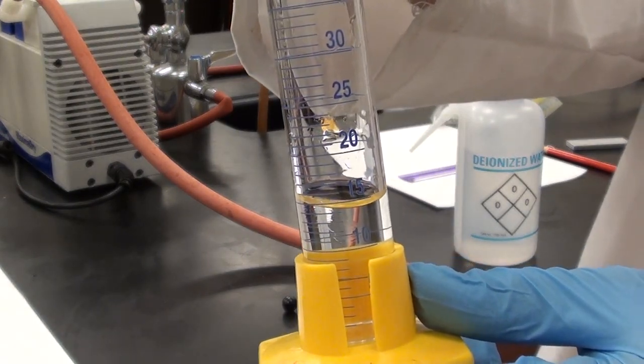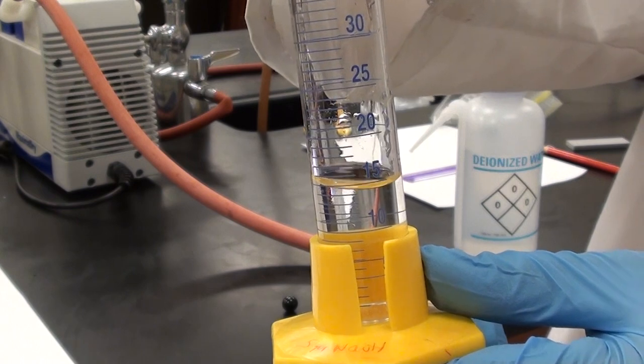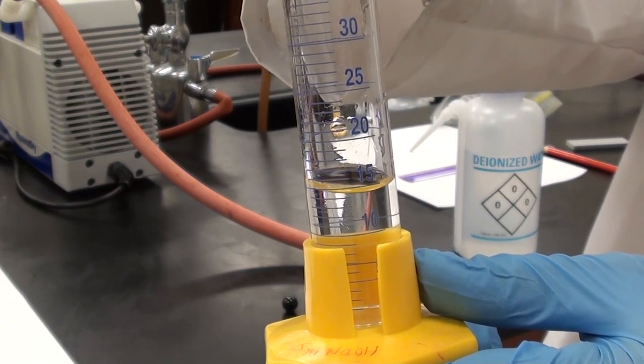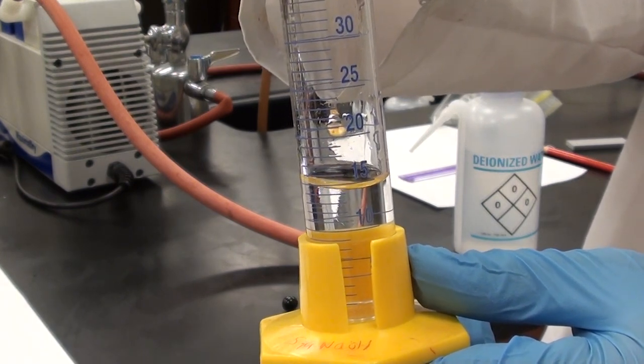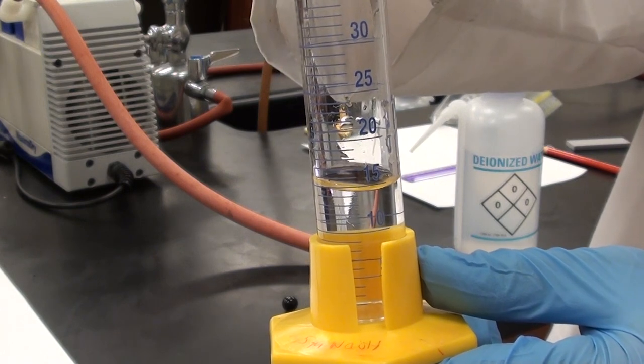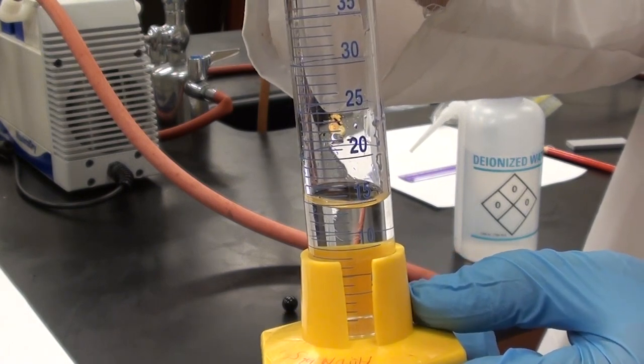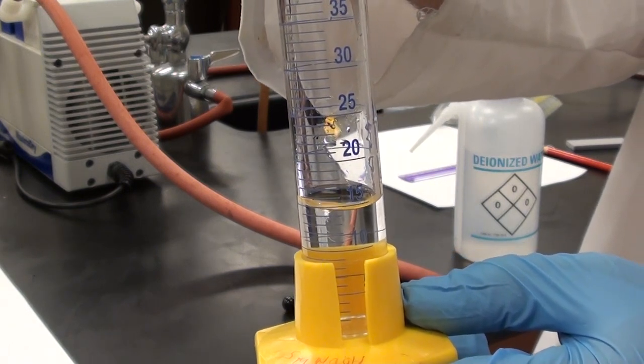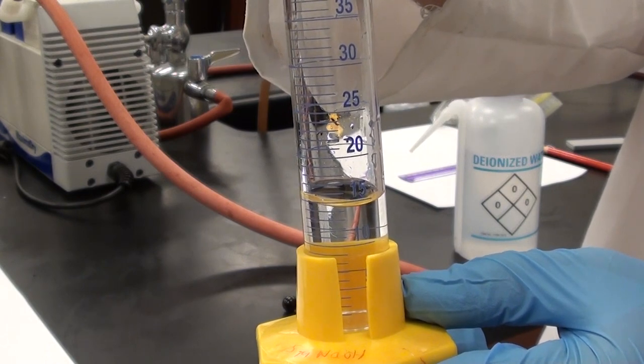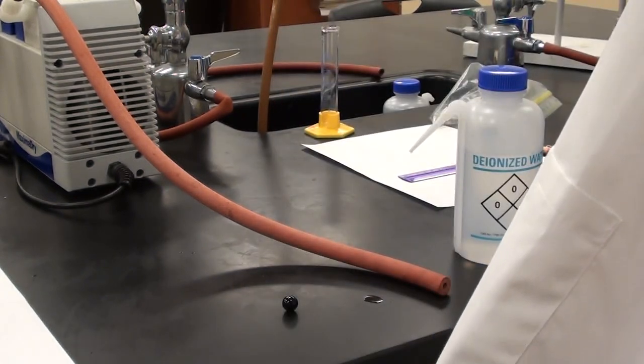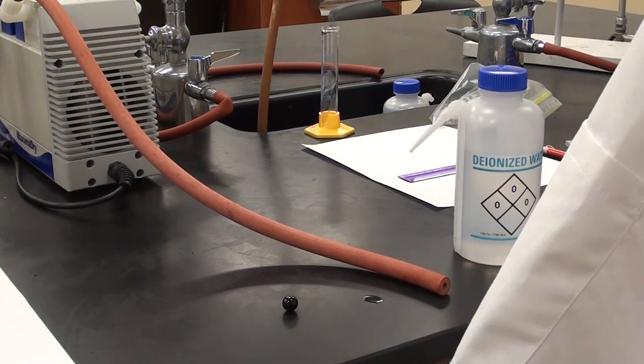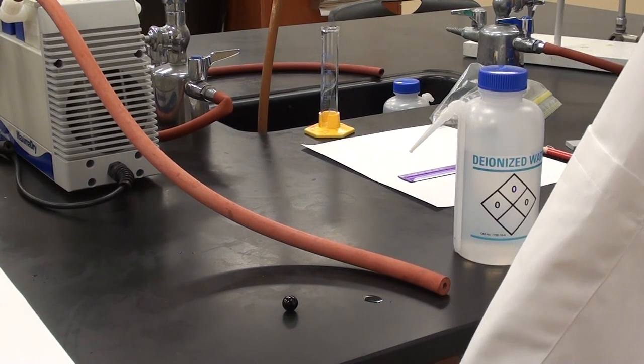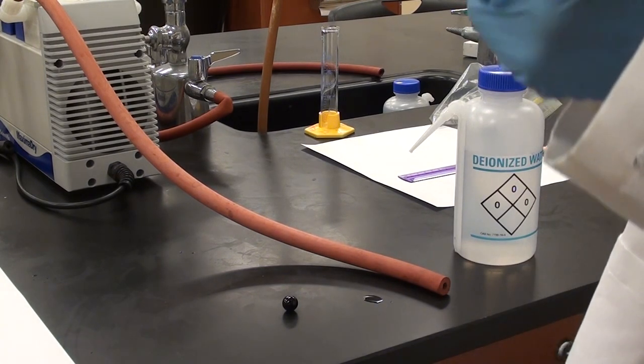So he's going to pull us up close to the camera. You can see what the graduations are like. Between 10 and 15, for example, you can see there's five lines. That means each of those lines is worth one milliliter. So that means we can have an accuracy of 0.5 milliliters. So if this is directly on the line, what would you measure that as, Jim, about 14.5? Yeah, about 14.5.